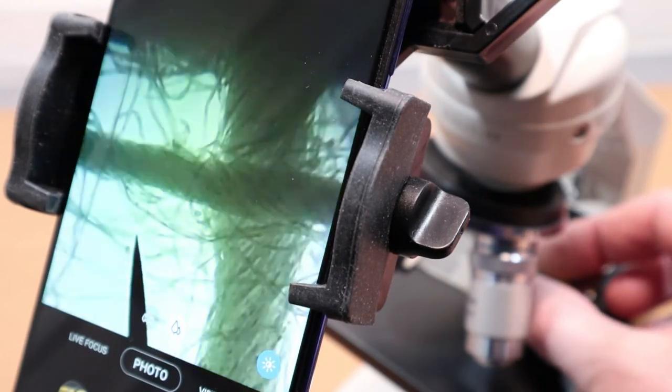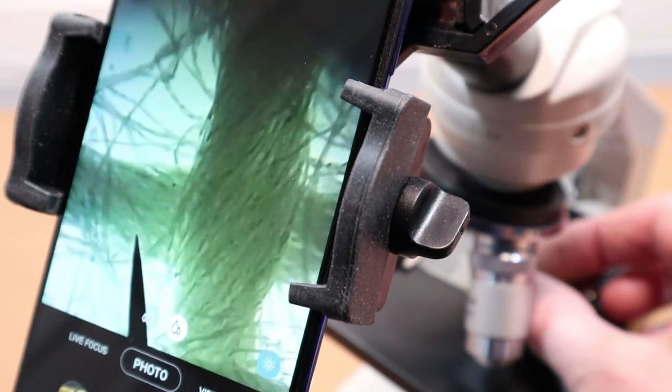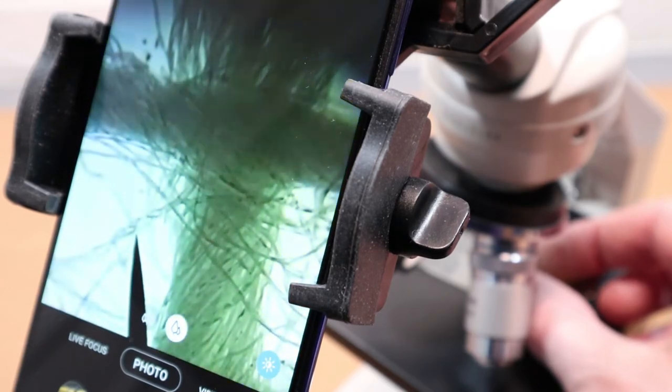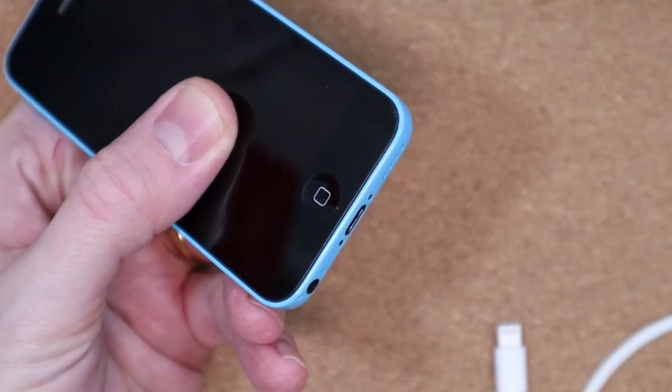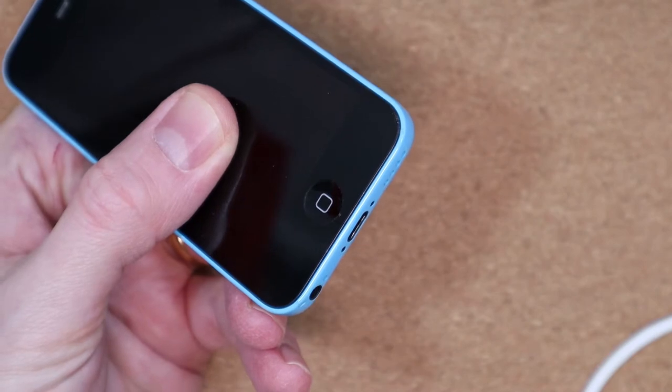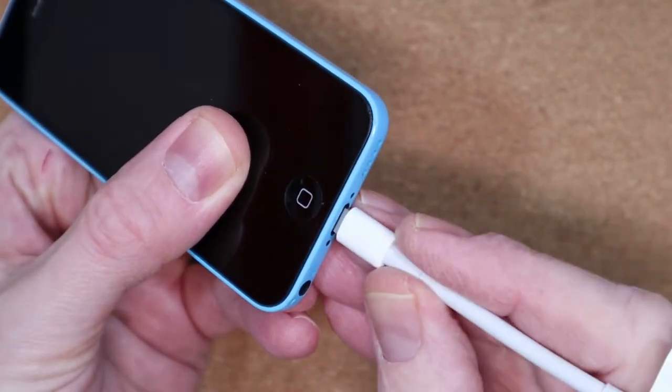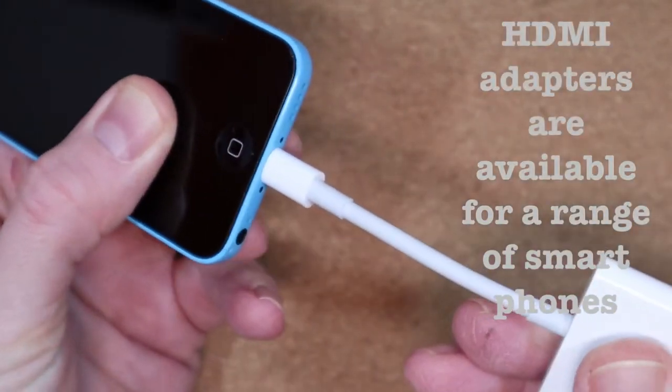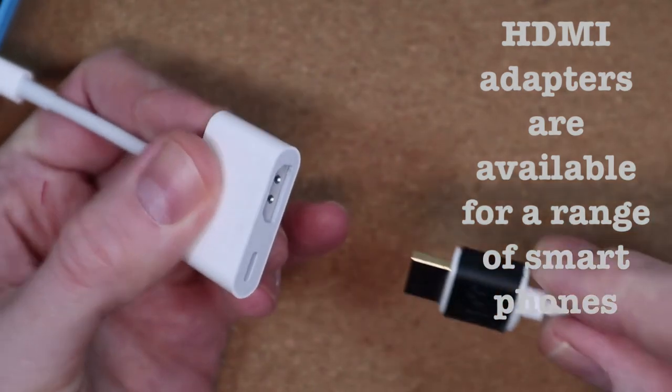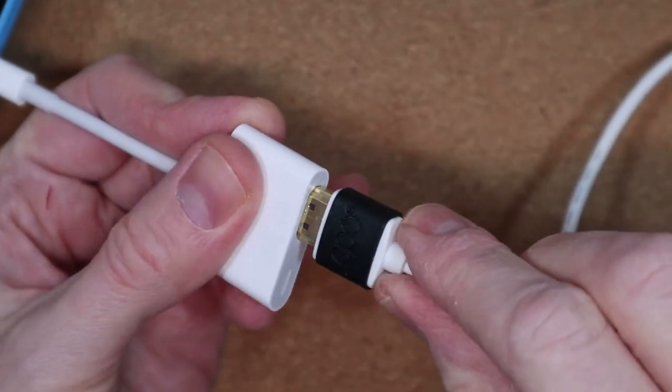Now I mentioned at the start that I was also able to livestream the image from the microscope, although to do that I had to use a different smartphone, an old iPhone 5c. The reason I use that is because I also have a lightning to HDMI adapter which allows me to connect the phone to a capture card so that images can be viewed on a computer.